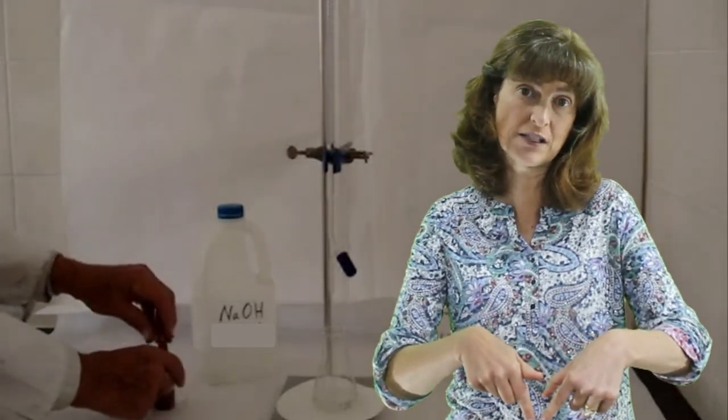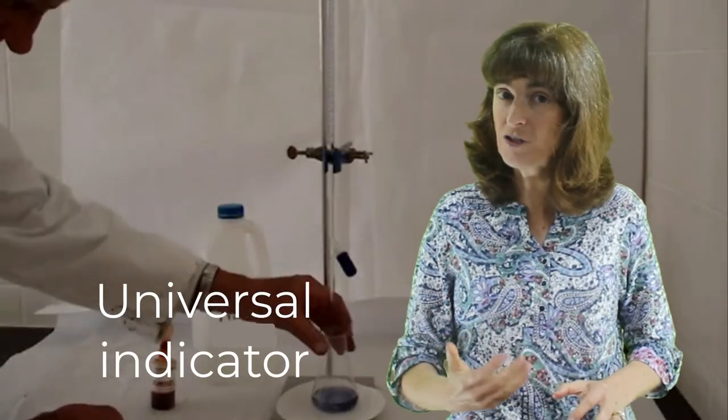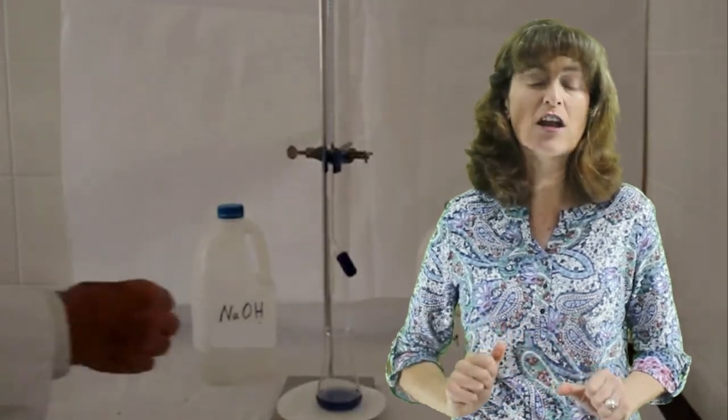That's why we need to add a pH indicator to the solution of interest. In this case, we've added universal indicator. And because the solution of interest is basic, it turns purple. Now we're going to add the acidic standard solution by titration.